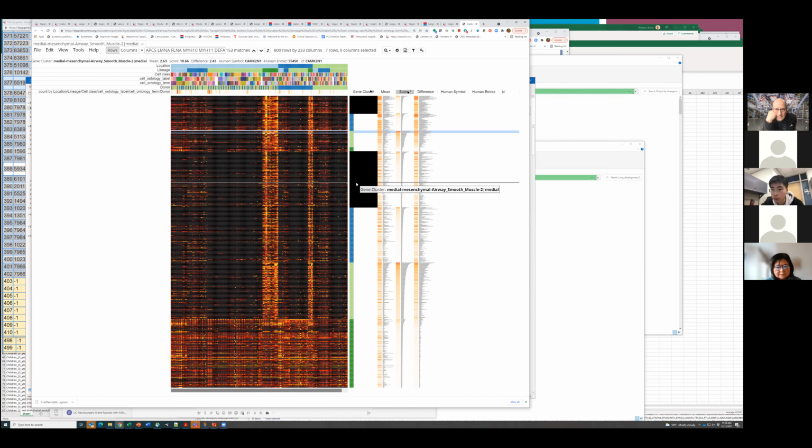And the scores that Bruce just showed, including the mean and the score, are the t-test statistical output. For example, the current state of the art could be MAST, but we are still trying to include that in the following versions, which can help us better understand more generic markers in single cell data.